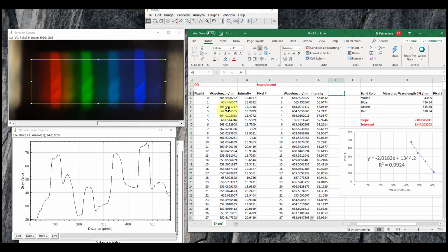So what we have here now is wavelength versus intensity, which is essentially a spectrum. So you've created the spectrum. These are emission spectra right now, so we could just take these two columns of data and plot it. But as the protocol will tell you, to get this converted to absorbance, what we need to do is take the actual intensity of a blank sample and divide that by the intensity of the true sample. That would give us the actual absorbance, which we could then plot as an absorbance spectrum.